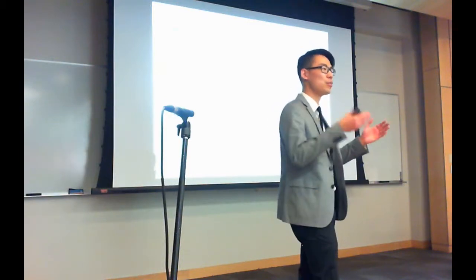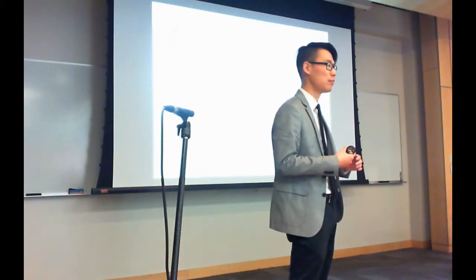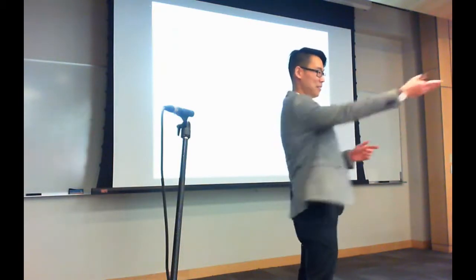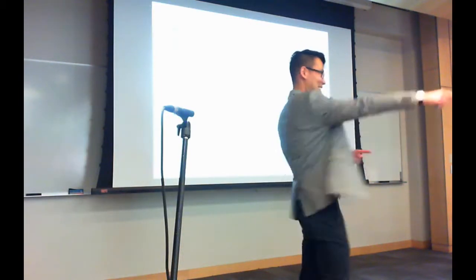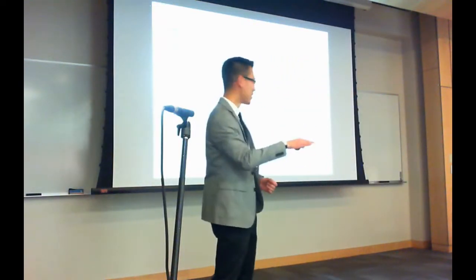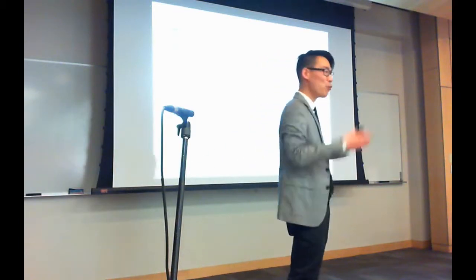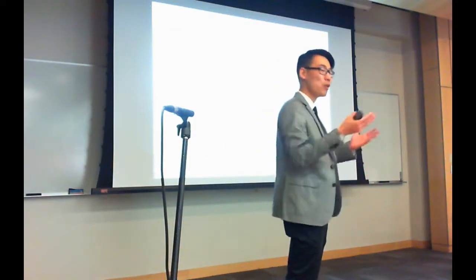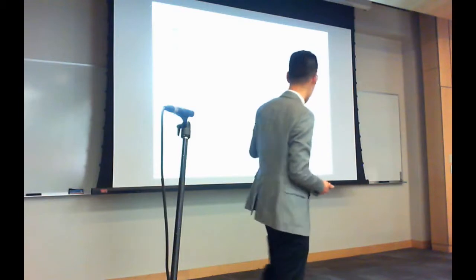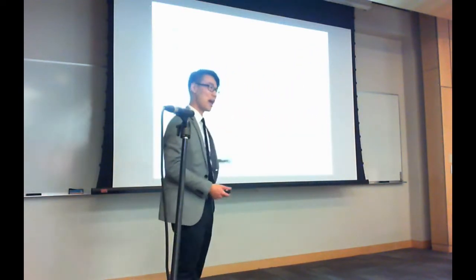Which one do you believe is more likely to be a correct match? Any guesses? Andrew? The one on the right. That's what I would think too. But the problem is, both of these have the exact same cosine score. But this one on the right, we believe, is more correct. And so we want to account for that. We want to assign significance to these matches.